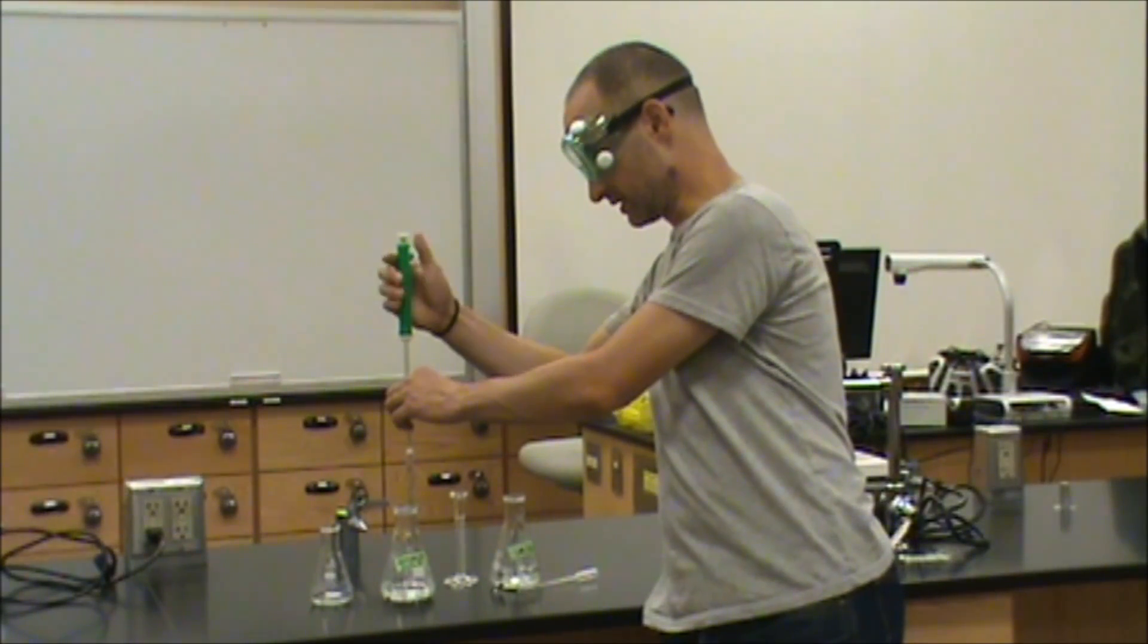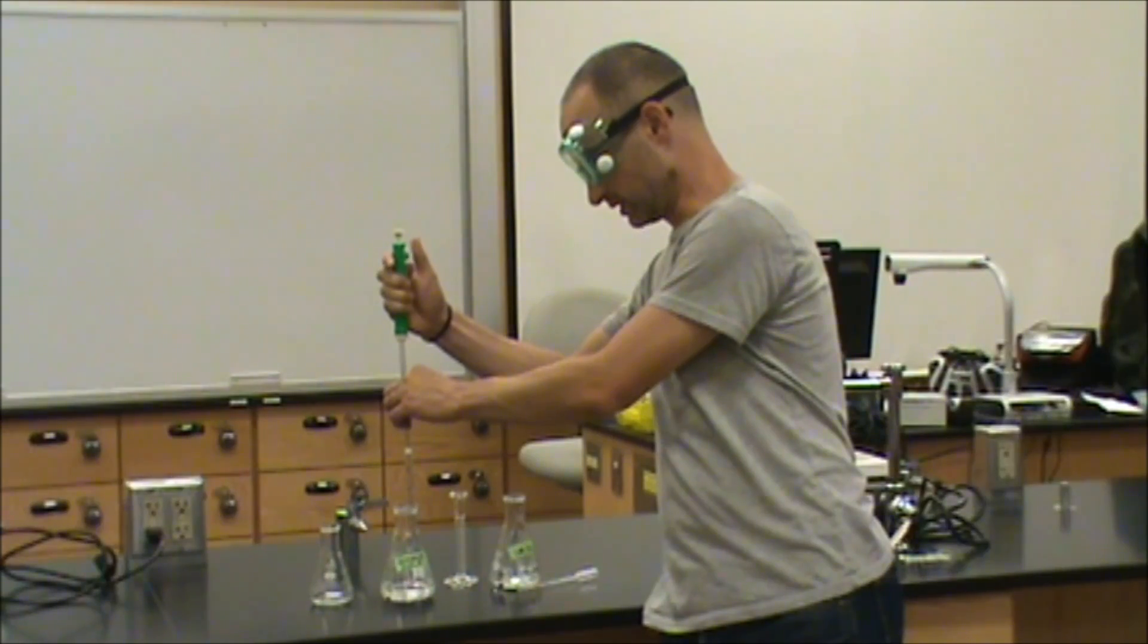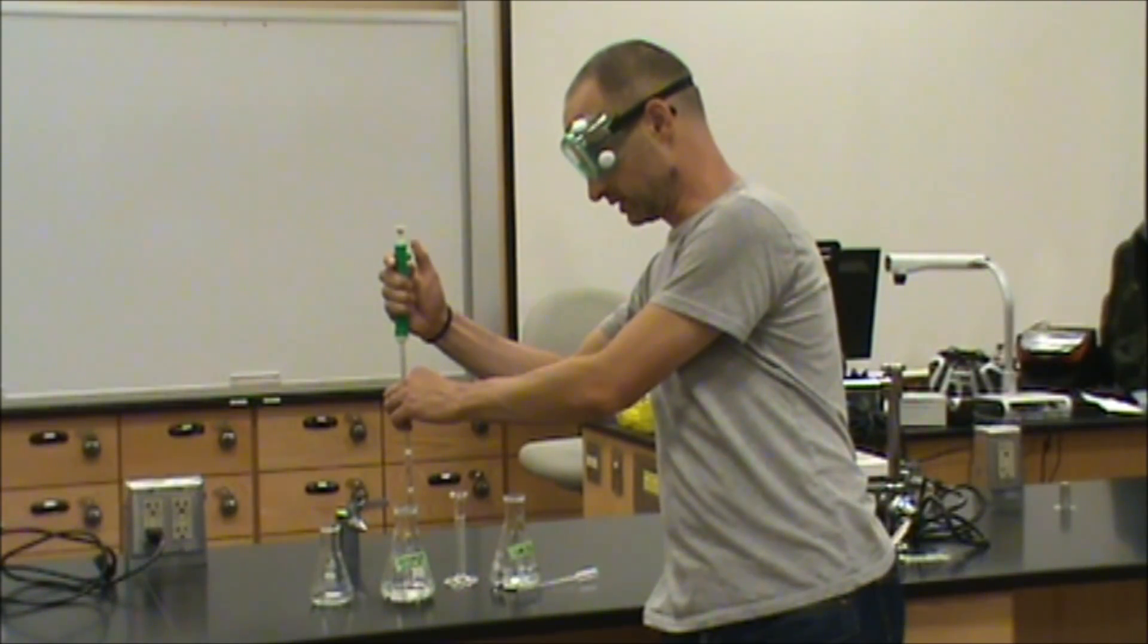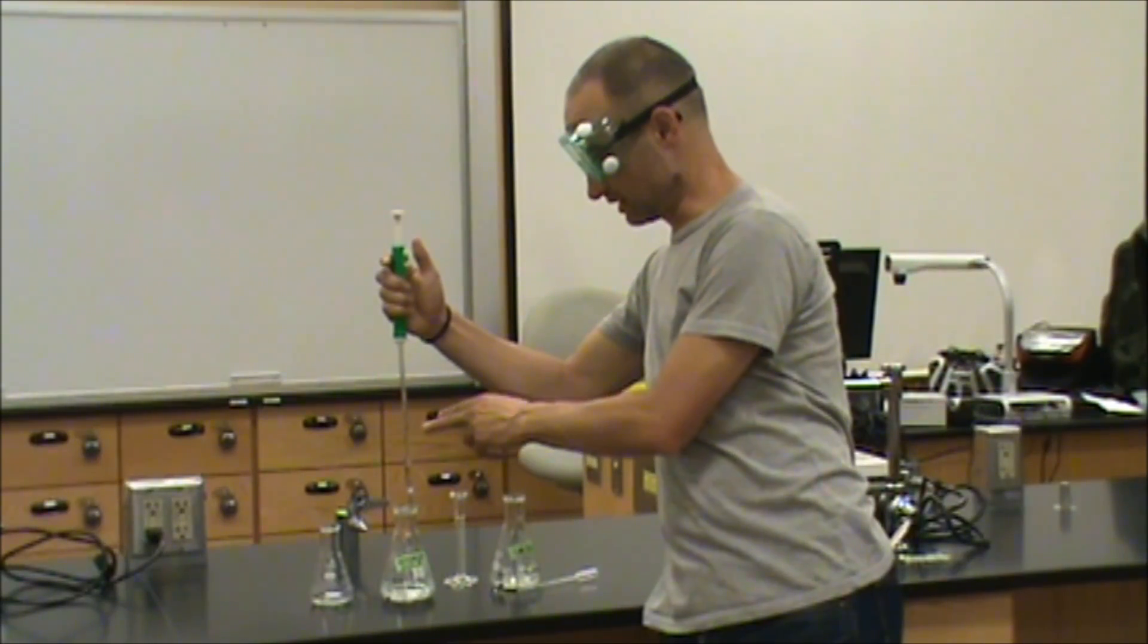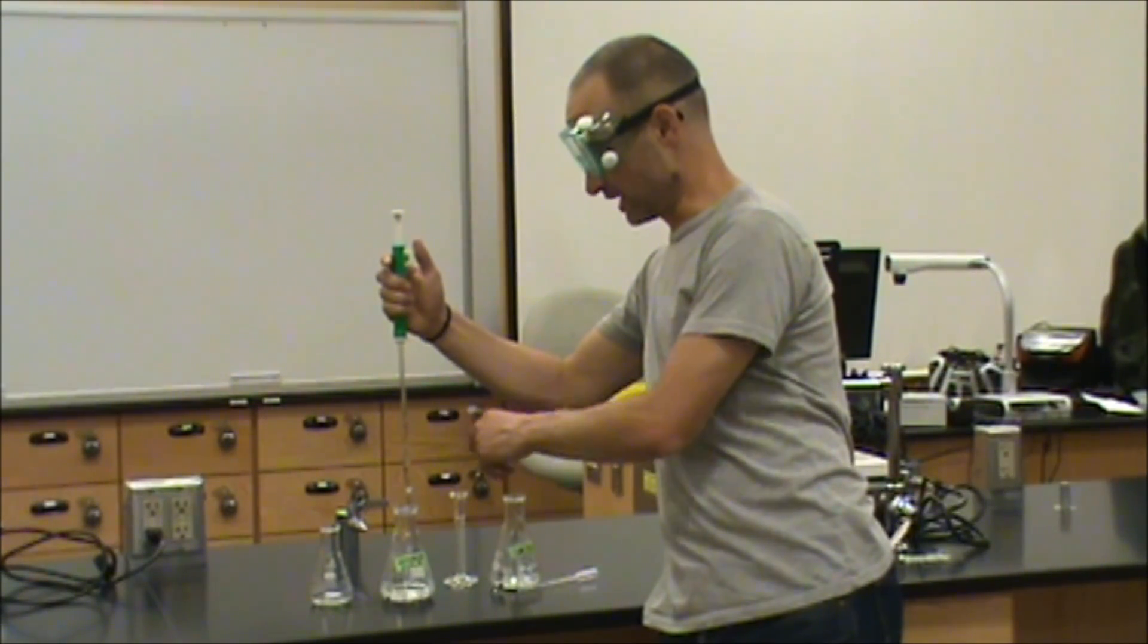As demonstrated in the acid-base titration tutorial, we want to use the thumb wheel to draw the peroxide up into the volumetric pipette until the bottom of the meniscus touches the marking that's just above the wide portion.